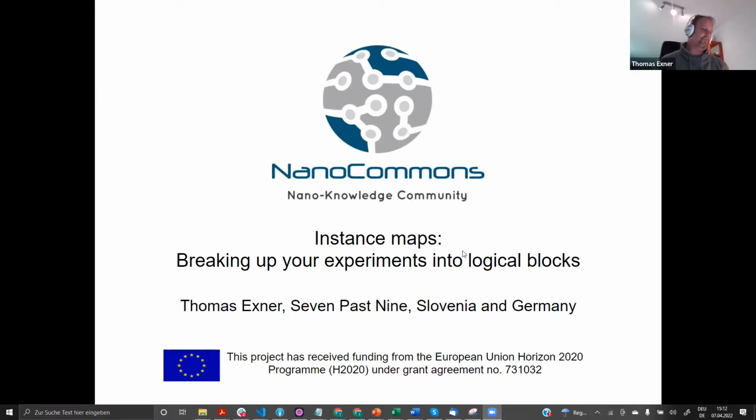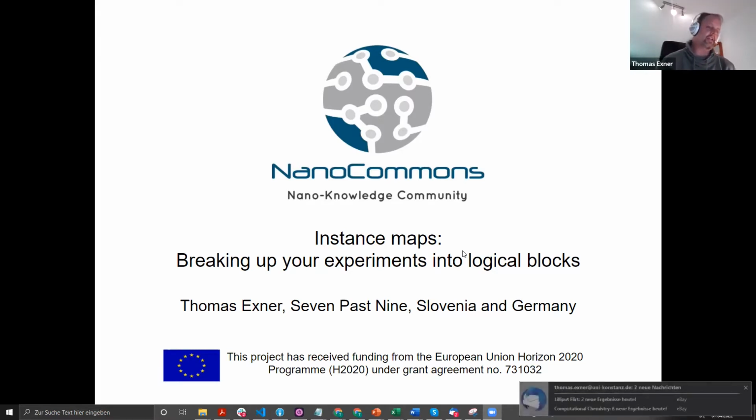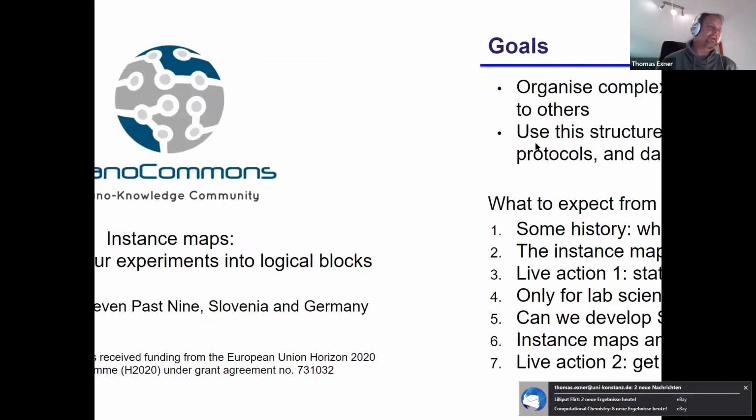I can probably directly jump into what we want to do, and the main point is really that we use these tools, but the tool is really also meant to perhaps change a little bit the concept of how data is managed in large projects, but also in your daily life. That you don't wait until the final end to think about data management, but that this is really something you try to do whenever it comes up.